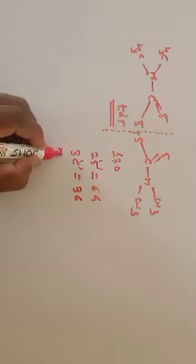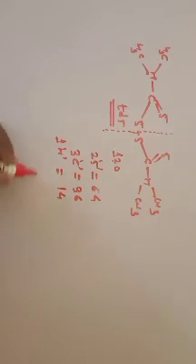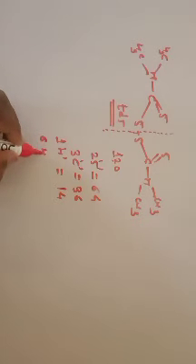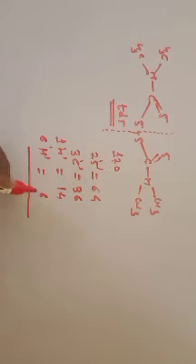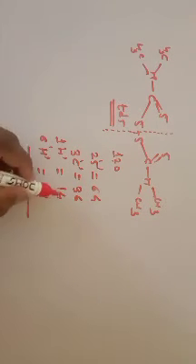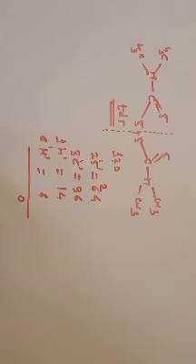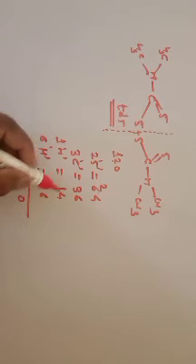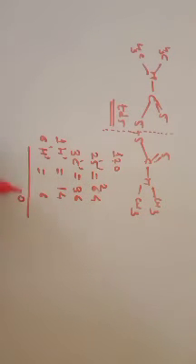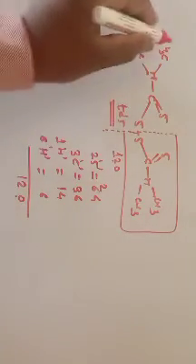Then there is one nitrogen, for which it is 14, and the remaining is 6 protons, so it becomes 6. So 6 plus 14 is 20, plus 36 and 64, total is 120. So the fragment which remains is this fragment, or it is this fragment.